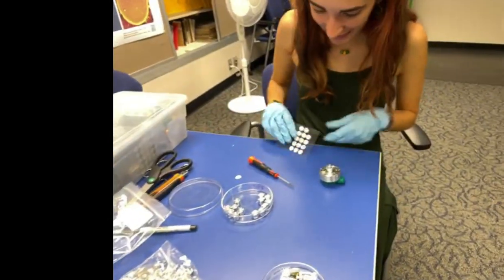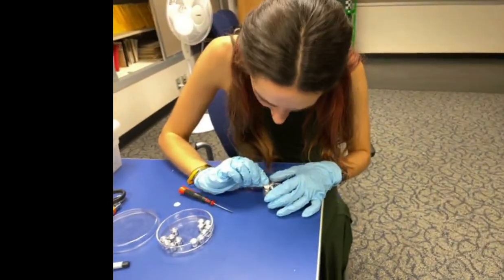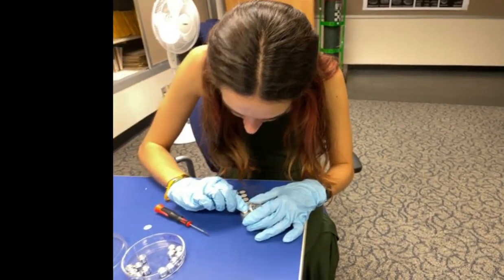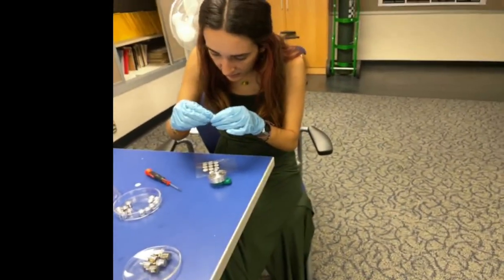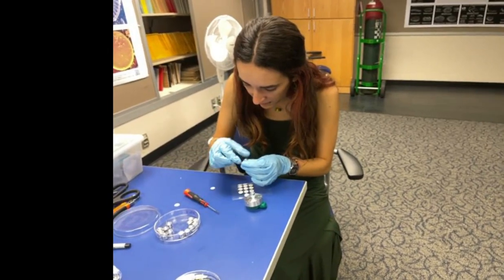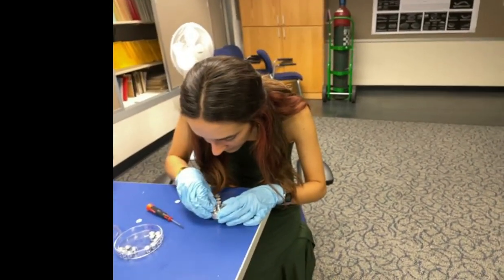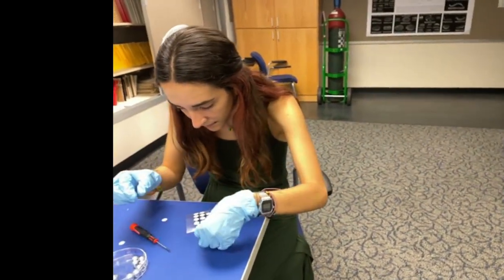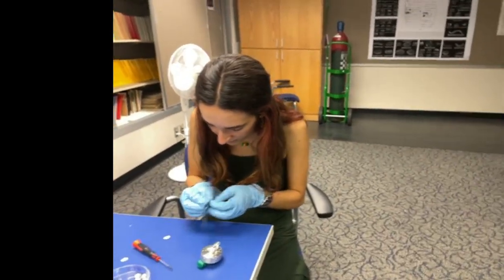All of the samples that we'll be prepping are from Grove Lake, which is the sample we looked at on Wednesday with Mark Edlund and Joe Mohan when they were here. I just prepped a whole bunch of them, because if you were here for that stream, you probably will recall that we found something, we don't know what it is, and we couldn't even get it into a genus.